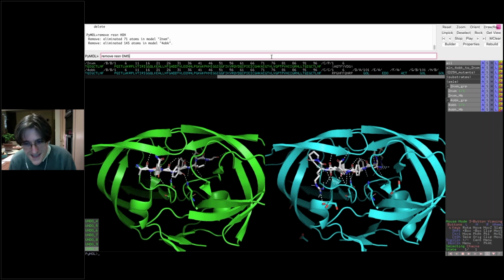So all of the states that you're seeing are, in principle, valid conformations that agree with the experimental data from NMR. If you were to stick them into a force field and compute their energies, you may get different answers. But that is the experimental data.